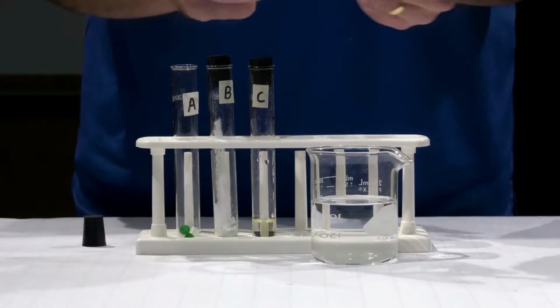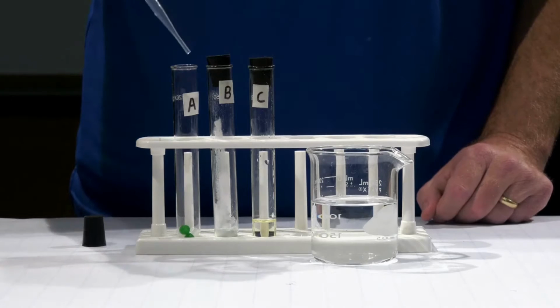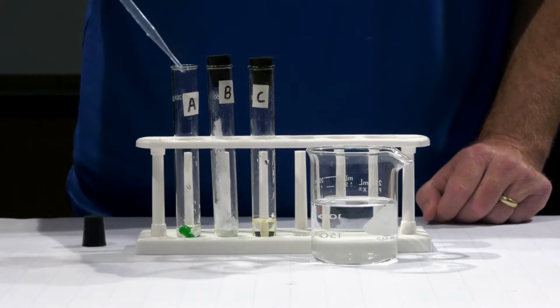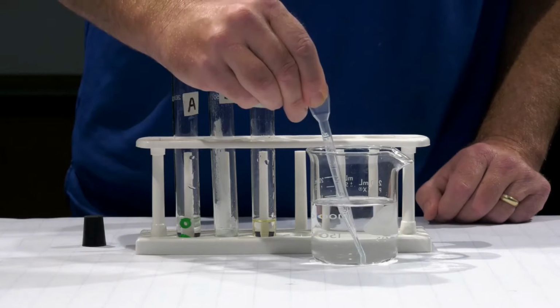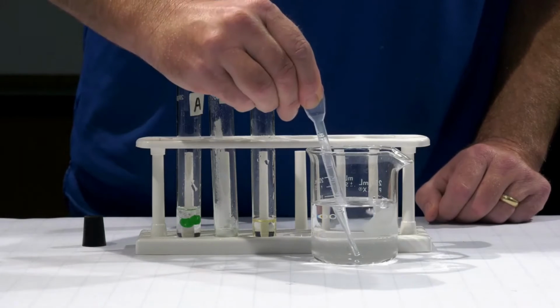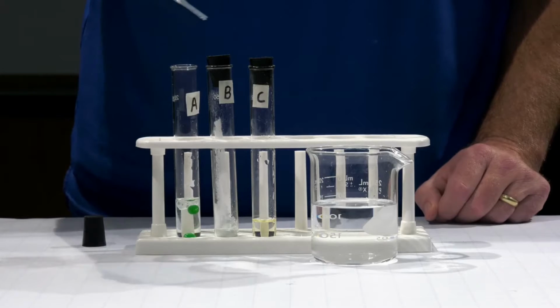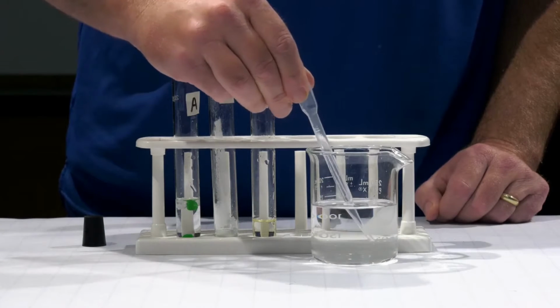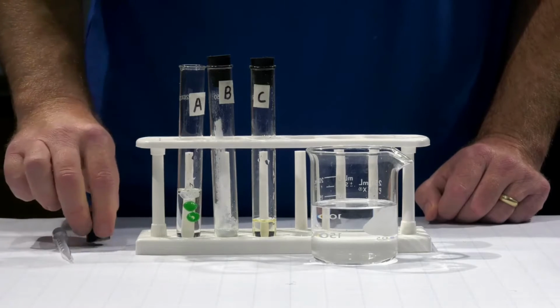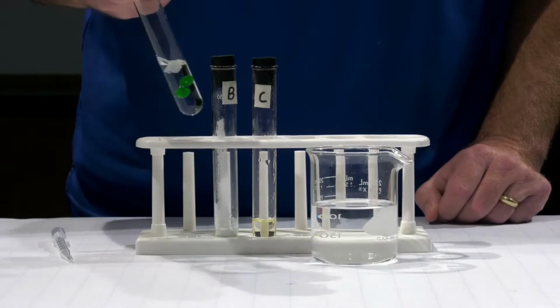The next step in the investigation is to add water to each of them and to see if any changes occur when we add water. After the addition of water, they will be shaken vigorously to see if that changes anything at all. So you will be filling out 3 different observation charts: before water is added, after water is added, and then after they are shaken.